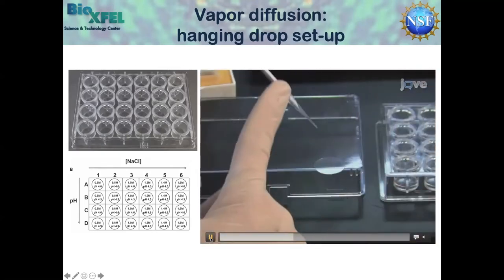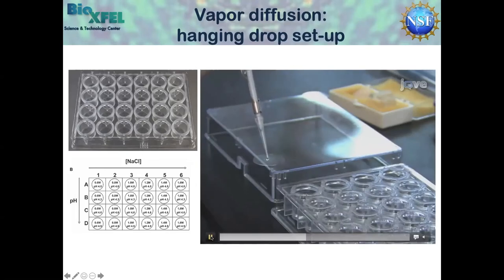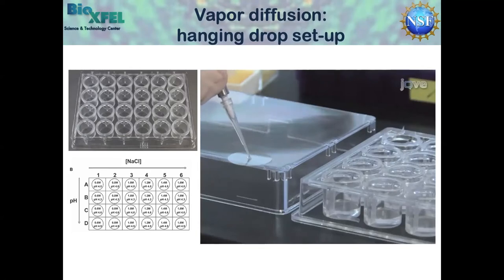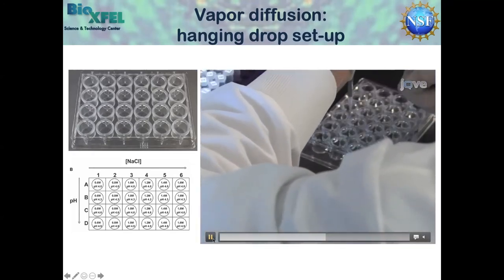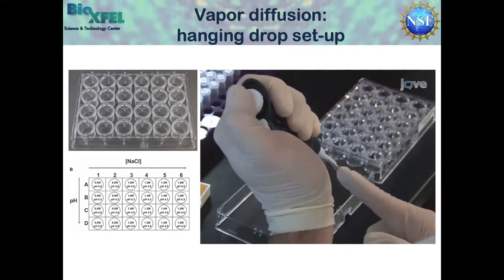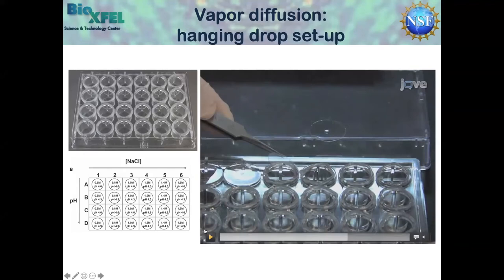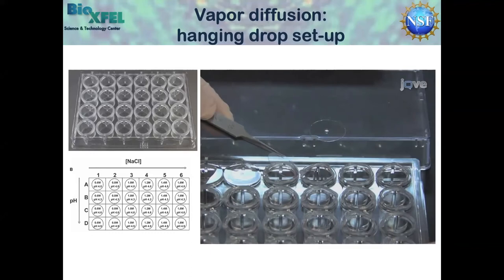Now they're taking their protein solution and putting it on the cover slip. You want to avoid air bubbles anytime you're working with proteins since proteins don't like air-water interfaces. Take the reservoir solution corresponding to the well you're sealing, combine it with the protein, and gently mix. Then use tweezers or forceps to gently pick up the cover slip, invert it, and place it on the tray. You want to do this directionally — if you just layer it on like a sandwich, you'll get uneven sealing. Each of these drops is an individual experiment, so if it's open to the environment, you no longer have that controlled diffusion. You also want to make initial notes when you set it up — some drops will be clear, some might show light precipitation. Set it in a temperature-controlled incubator. Even at room temperature, it's good to avoid fluctuations because crystals are fragile and susceptible to environmental changes. 20 degrees C is the most commonly productive crystallization temperature, though 4 degrees is also very commonly used.